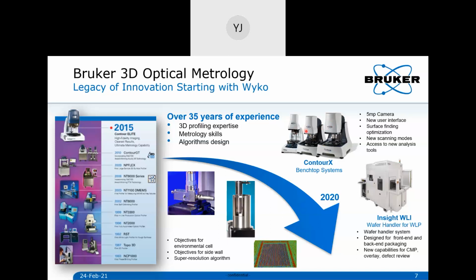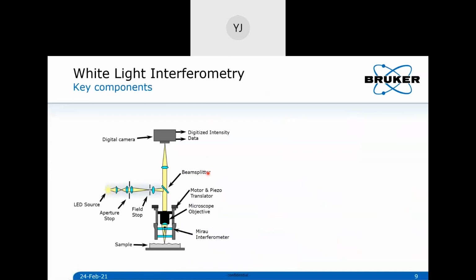That's why this technique, when combined in the form of a microscope, gives you a great understanding, almost at sub-nanometer levels sometimes. It has been adapted for different industries, from lab scale systems to full-blown systems with wafer handlers for the semiconductor industry. And we have some dedicated systems, small snapshots you can see here, for the automotive industry, where you're dealing with larger, heavier components than you might in a lab scale or semiconductor environment. So it's been adapted to different industries.